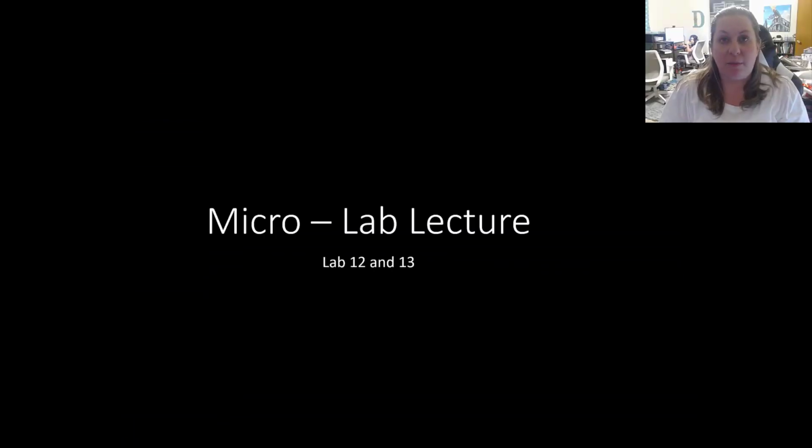We're going to be diving into the biochemical tests that we're going to be doing for lab 12 and 13. The first set of tests I want to talk to you about are going to be the focus more for lab 12, and these are going to be rapid tests. They're tests that we can do relatively quickly. They're going to take only a few seconds or a few minutes to get results, and so those are going to be the ones we're going to discuss first.